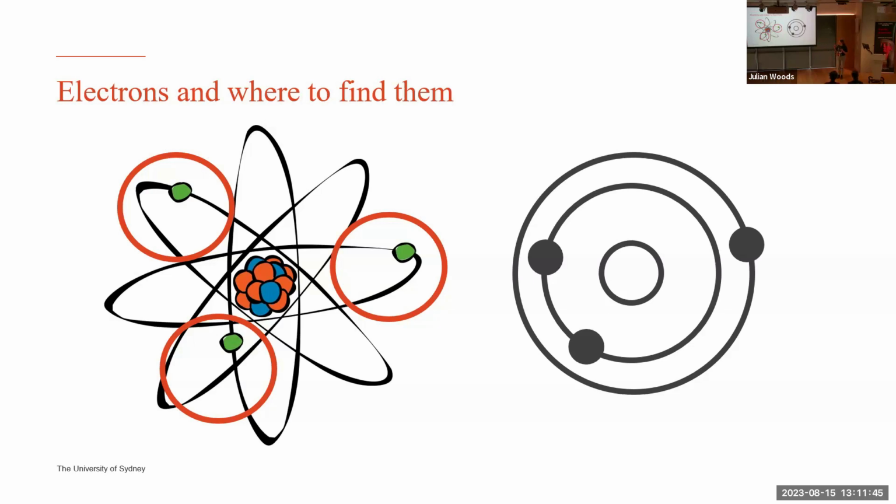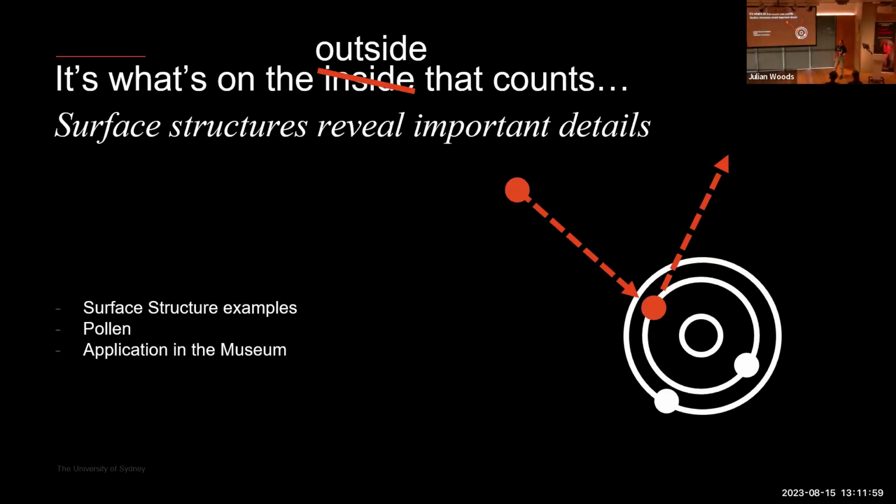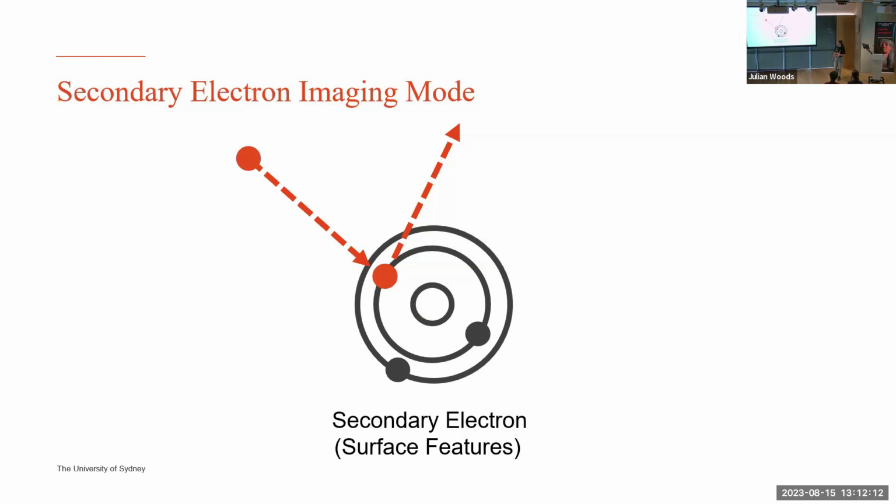And this is really important to remember throughout our talk, because it's those different energies that give us different information about a sample, like what it's actually comprised of in terms of elements. So first, before we go into elements and what makes up them, let's just look at it on the surface level. And the way that we do this, with our electrons shooting at the sample, is through a very specific interaction we detect as a secondary electron.